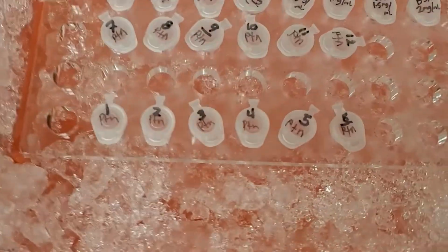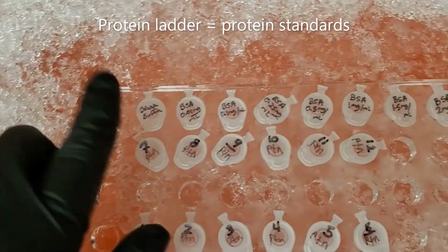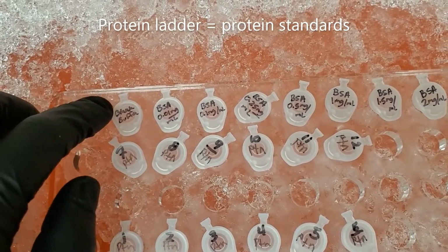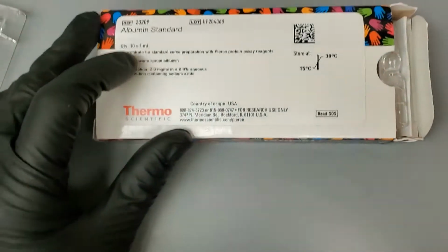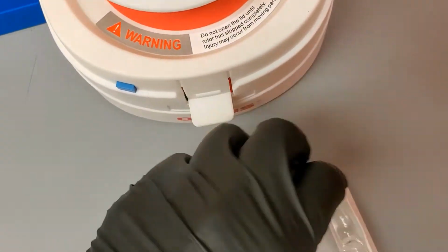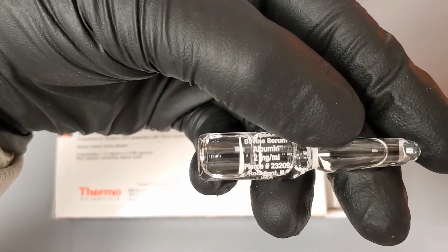Another thing that it's important to have is the albumin standard that we use in order to make our protein ladder. So we have blank buffer, which is our RIPA buffer that we use to lyse our cells, and then these are the concentrations that we use to make our ladder. You can optimize that the way that you want it. And our albumin standard is basically what we dilute. They come in these little ampules that you can see here, and it brings 1 milliliter of 2 milligrams per mil of this bovine serum albumin.